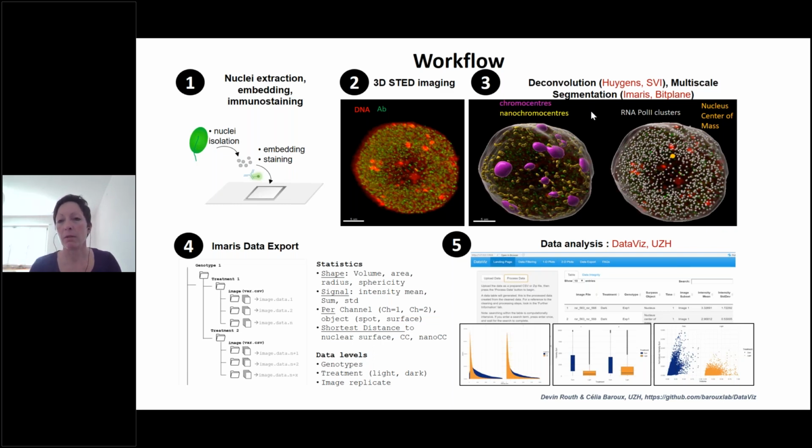For this segmentation, there are actually many software available in the community, and there are open source softwares. One of them was presented by Dimitar Prodanov last week. But there are other software, and there are also commercially available software. Here I'm not here to make advertisement for the commercial software. I can only present the software we are using. It is called IMARIS, produced by the company BitPlane.